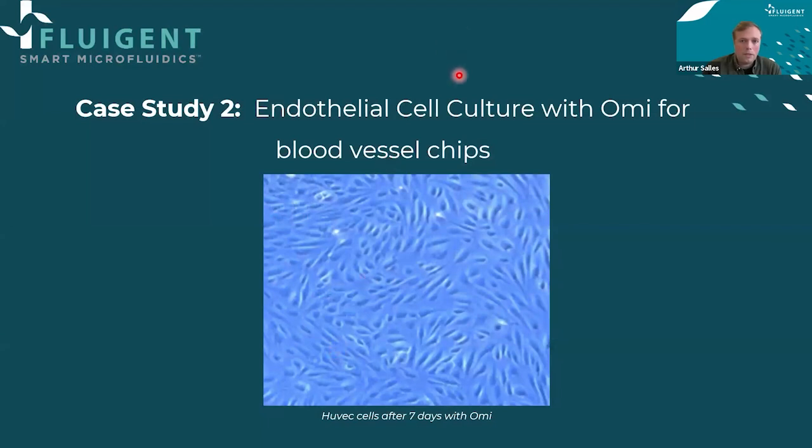So now I'll let my colleague Lucas present to you the endothelial cell culture. Hello, everyone. After the gut-on-chip model that was presented by Arthur, I'm going to introduce the culture of endothelial cells with OMI in order to develop a blood vessel on chip.